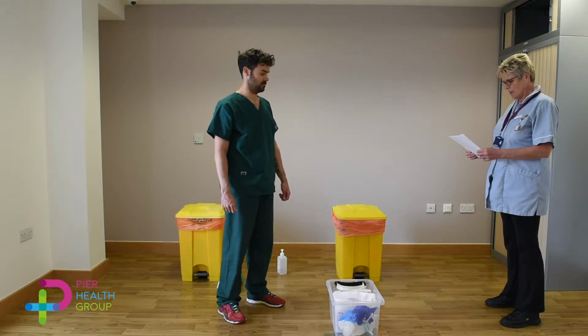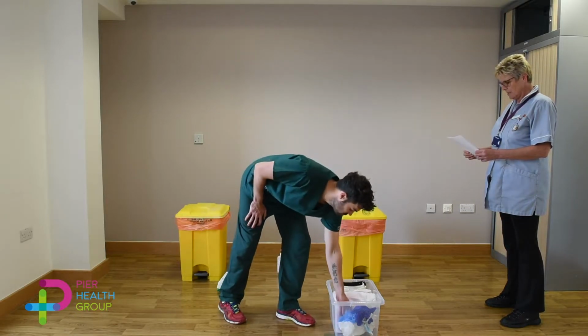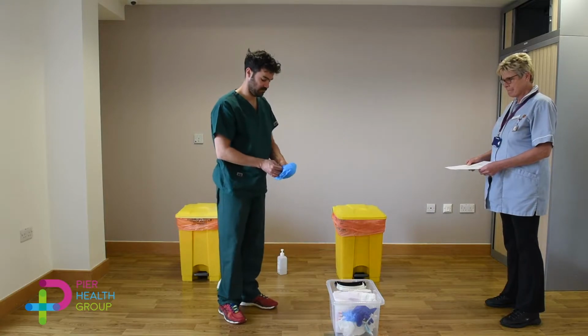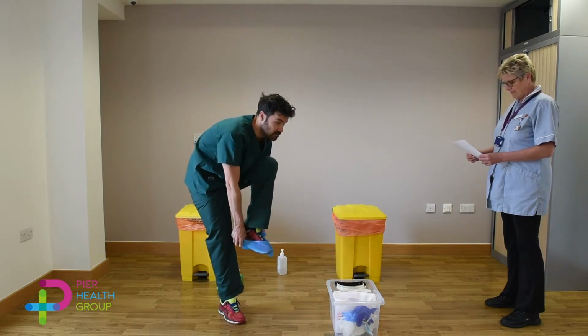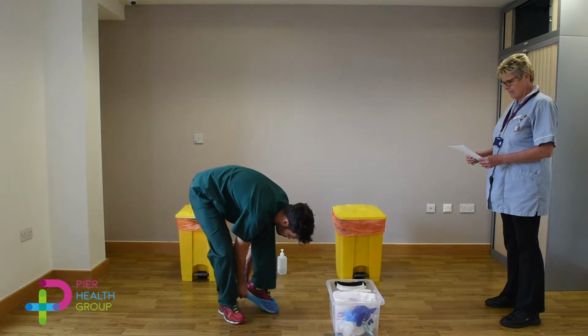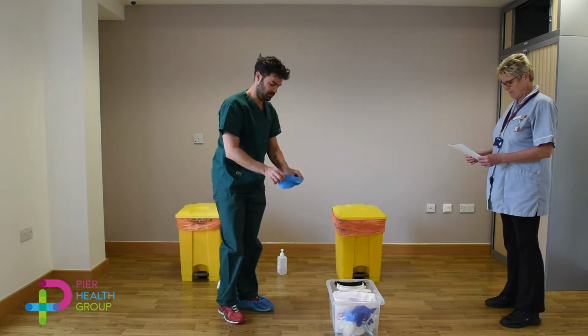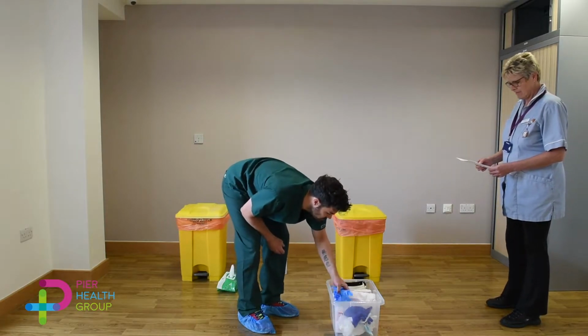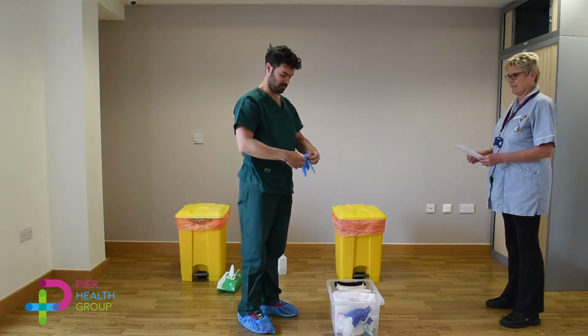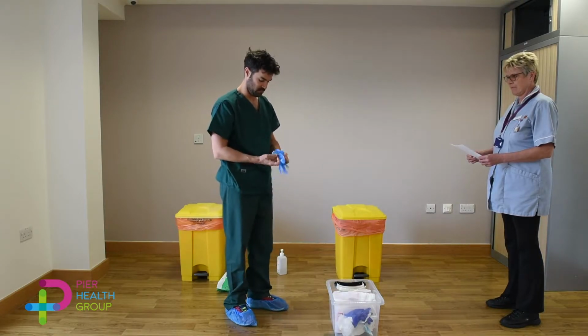Donning. Step 1 to dresser 1. Place on overshoes over your own footwear. If double gloving, place on inner gloves.